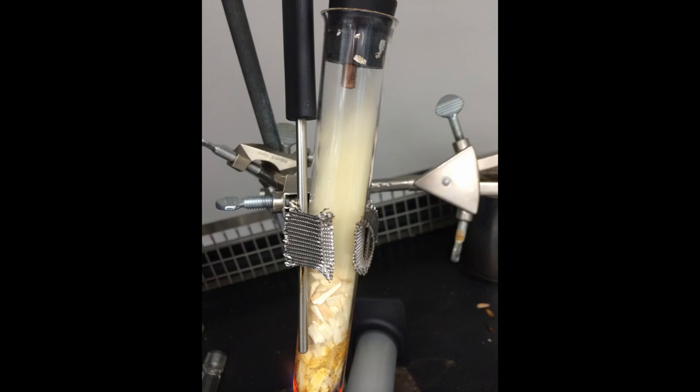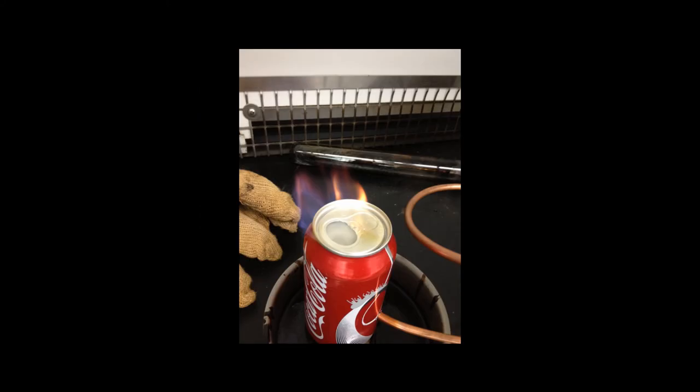Record observations and the amount of time it takes for the gas to start being released from the end of the tubing. Once a steady stream of gas is produced, light a match and hold it 2 centimeters from the tubing, or the exit of the gas flow. The gas should start to burn.